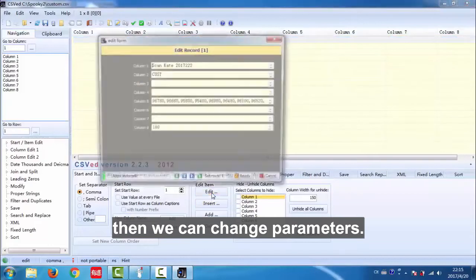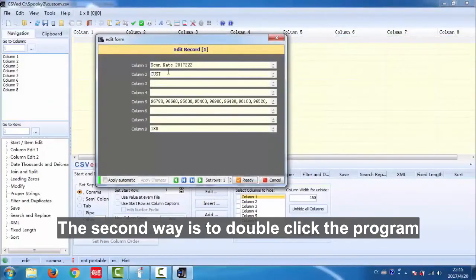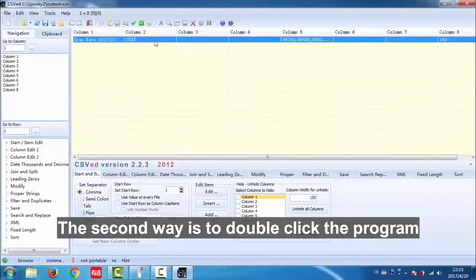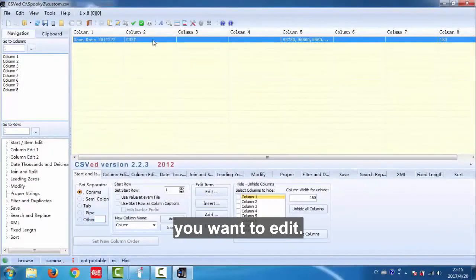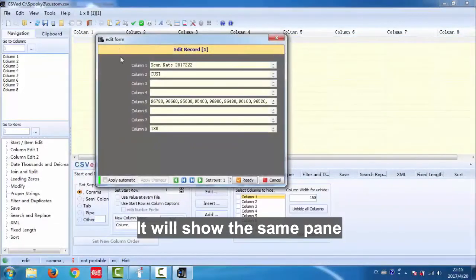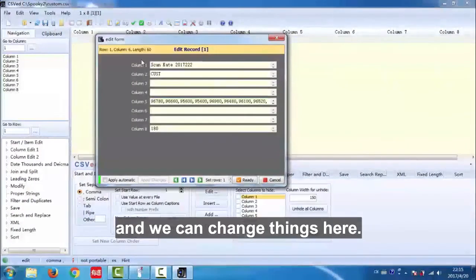Then we can change parameters. The second way is to double click the program you want to edit. It will show the same pane and we can change things here.